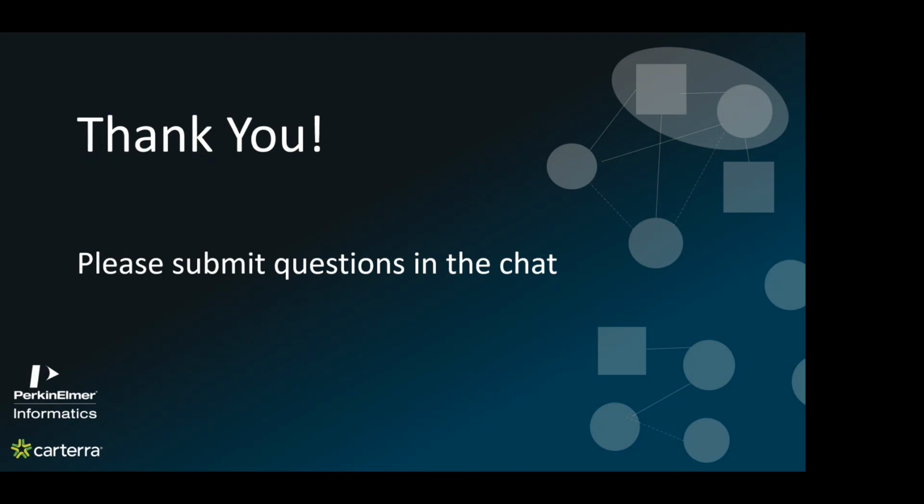Let's see here. There's a couple. Is it possible to combine multiple assay types into a single run, and does that complicate data analysis? Yeah, for the first part of that question, yes, you can definitely combine things. There's a queuing functionality in the Navigator control software of the LSA that lets you take different methods and put them together. So you could run kinetics and binning, or quantitation and kinetics, really largely any combination that you want, and you'll get everything done at once, which is great. You don't have to come back and run multiple small experiments. In terms of data analysis, the output is a single file, but it has subsections for analysis. So it is not difficult to perform whatever specific analysis needs to be done on the individual components of that file. It is very straightforward.